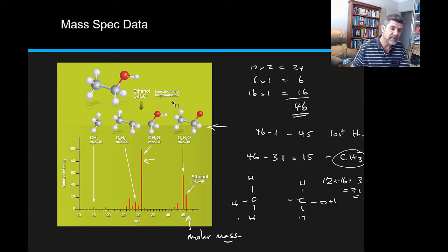But then this idea of fragmentation does allow us to look for where the molecule may have been broken, where fragments may originate from. And so you can see that there are some values that are present on this output and some values that are not. And specifically for those larger peaks, they are giving us a really good indication of where those fragments are coming from.